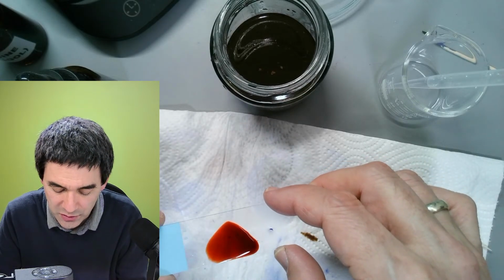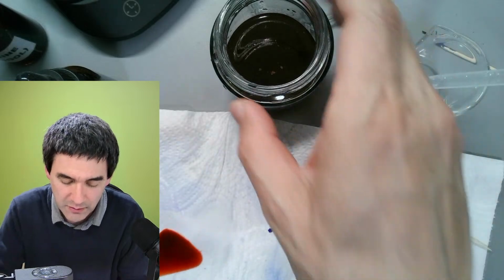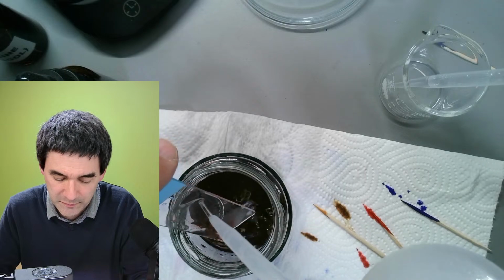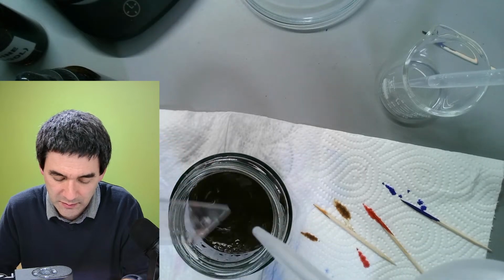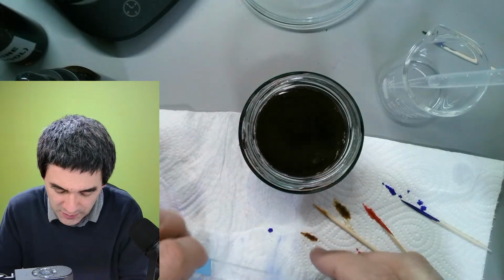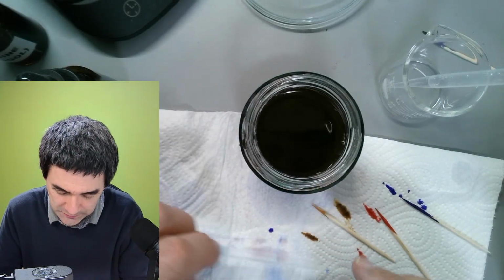I'm also going to rinse this off. I'm going to now dry it again on the coffee warmer.